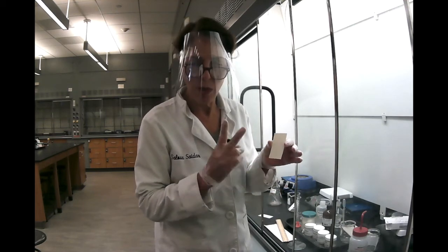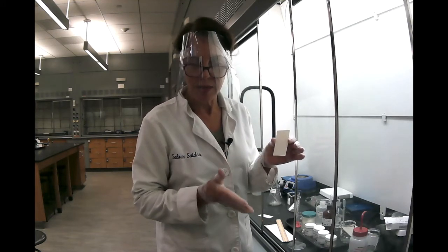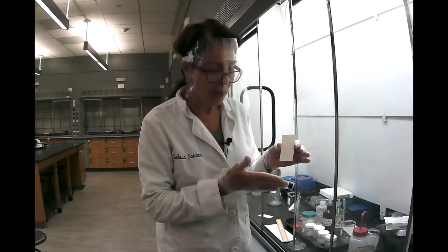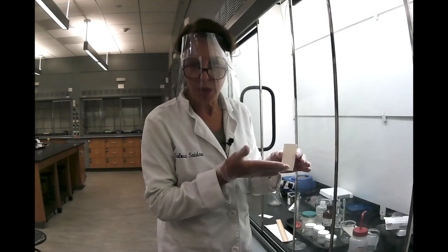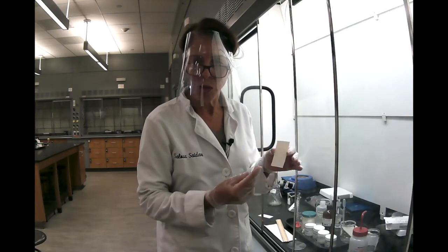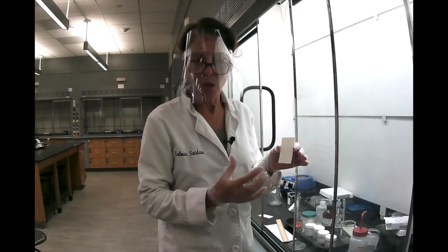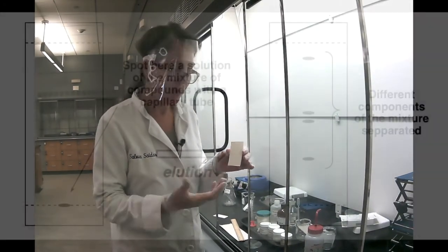So we always have two phases, a stationary, which is the solid, and a mobile phase, something that moves, and in this case it's going to be the liquid. And when you develop a TLC plate, the liquid will be pushing your substance upward, and of course it will push it based on the intermolecular forces it makes with your substance. So you have two competing intermolecular forces, the ones between your substance and the solid, which is the stationary phase, and the ones between your substance and the liquid, which is the mobile phase.